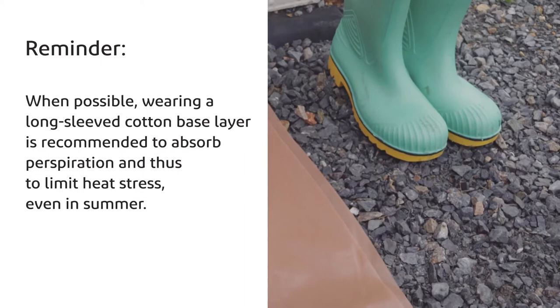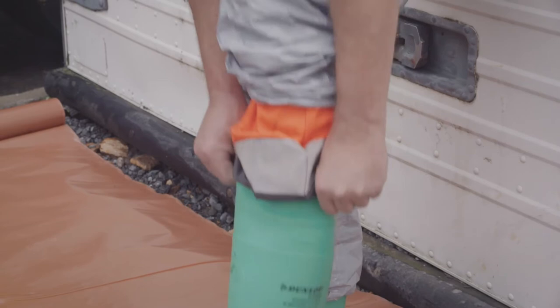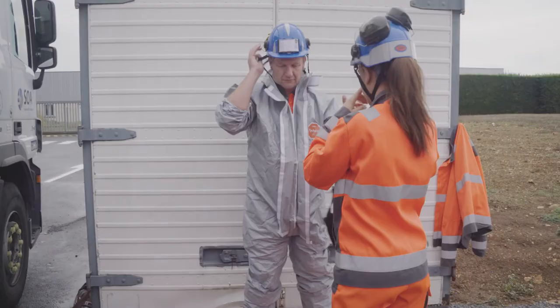Put the coverall on. Put your boots on. Pull the cuffs over the boots — do not tuck them inside the boots. This will avoid contaminating the inside of the boots and ensure the dissipation of electrostatic energy.